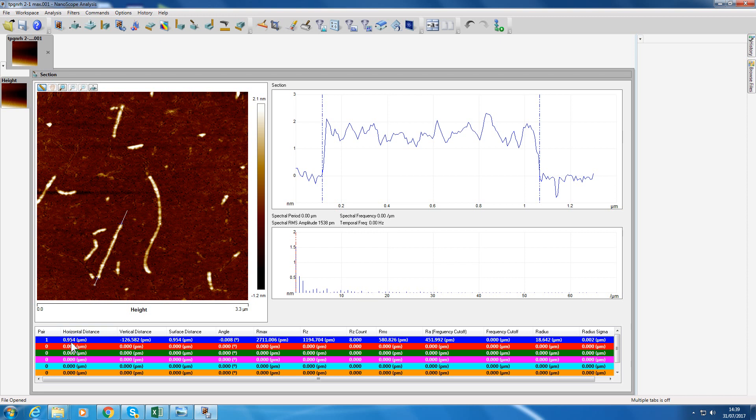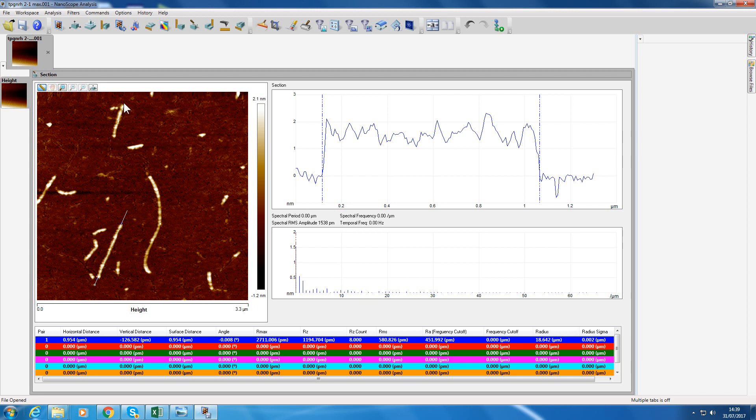The length is indicated down here: 0.954 micrometers, so 954 nanometers. That is the horizontal distance, so it'll be the length of that fiber. You could go around measuring the length of another one.